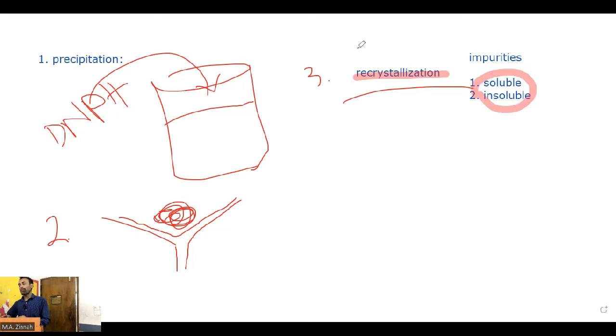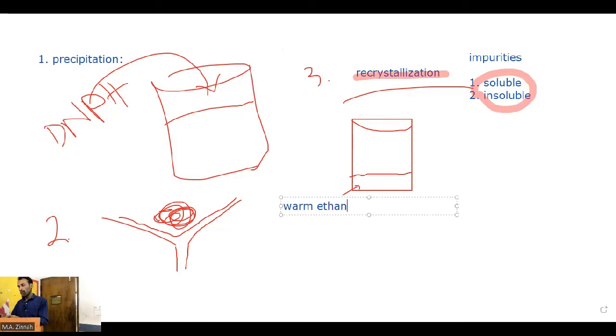The first thing you will do, কি করতে হবে প্রথমে এটাকে dissolve করতে হবে. For recrystallization you need to dissolve this. Okay, dissolve this, and it is a beaker. Take a small amount of what is there? বলো দেখি কি দেখেছো নোটে? Warm ethanol. Warm ethanol. This is the solvent. Because the solid already got there, insoluble in water, right? পানিতে dissolve করবে না, বুঝাই গেছে, নাহলে তো precipitate হতোই না.